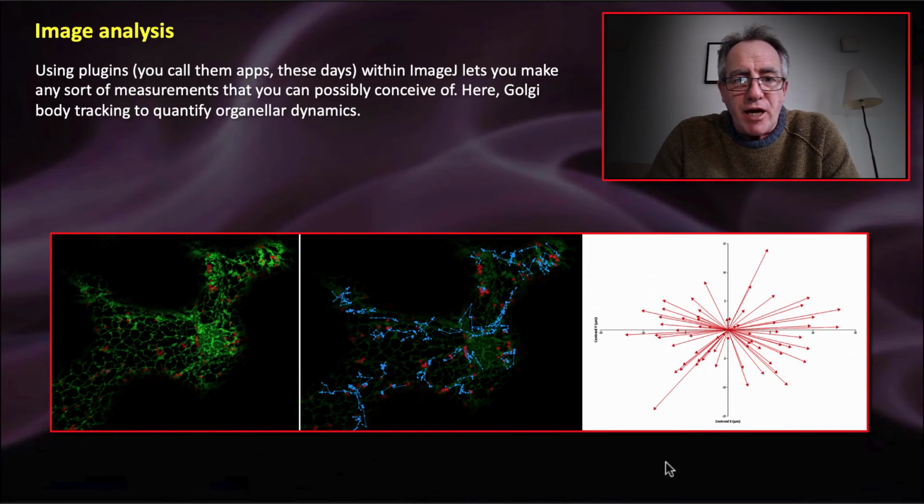So here's an example of one of those image analysis techniques, one of the thousands of techniques that you could do. This image here is part of an epidermal cell from the leaf of a tobacco plant. Endoplasmic reticulum marked with green fluorescent protein, Golgi bodies marked with red fluorescent protein. I call that the Scottish Terrier image. I don't know if you can see the dog, his ears, his nose, his beard, his tail, his legs. Front legs are bent up here. So in the Scottish Terrier image, we've got lots of stuff marked that we can analyze.